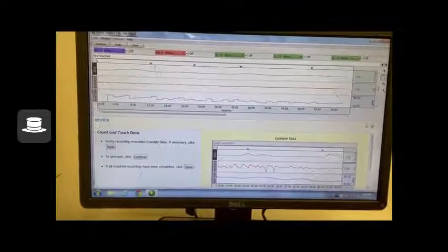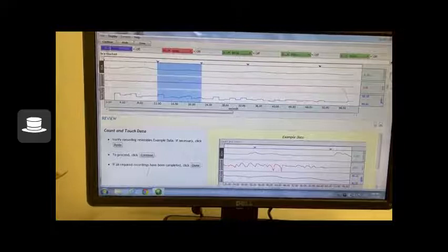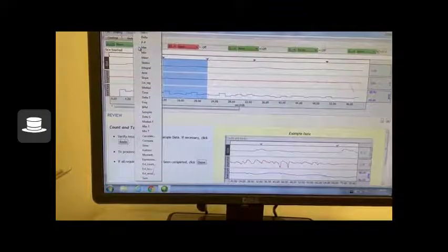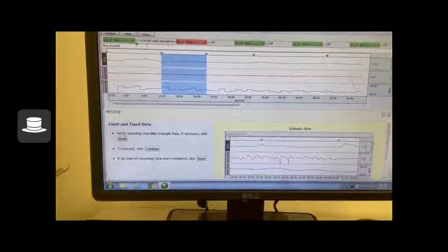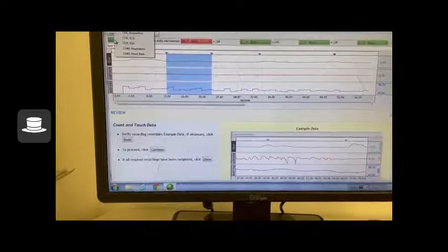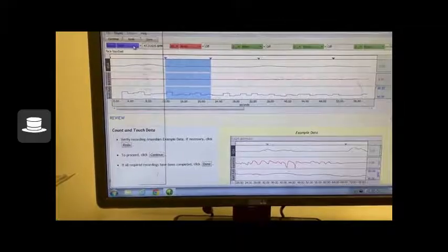Select the cursor as shown and begin highlighting sections between the arrows above. These arrows represent the beginning of a new question being asked. So now you can go through, highlight a section, and find the peak heart rate and EDA while the subject is completing each specific task, as well as what their heart rate and EDA were before they began the task. Do this by changing the tabs as I am doing above.